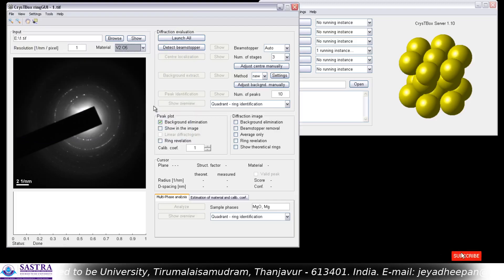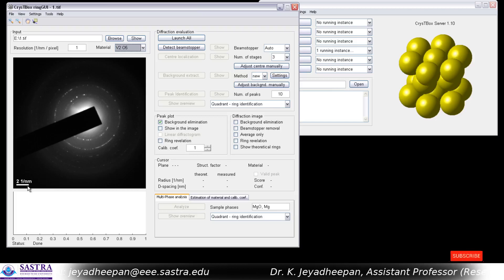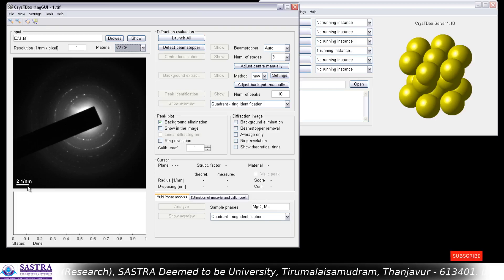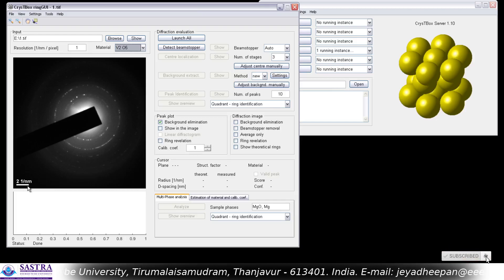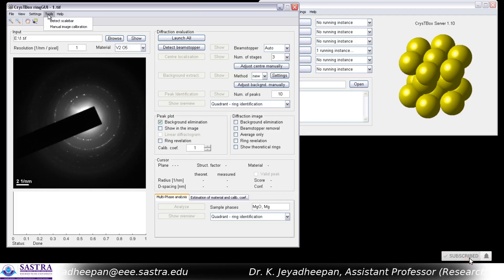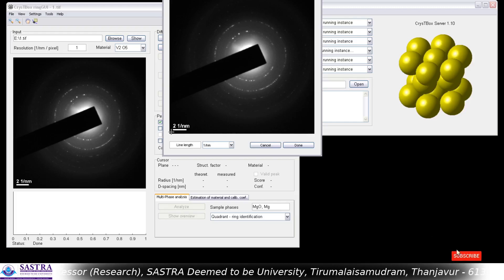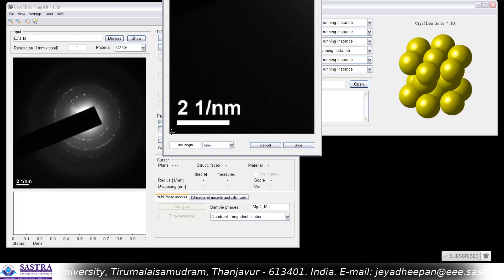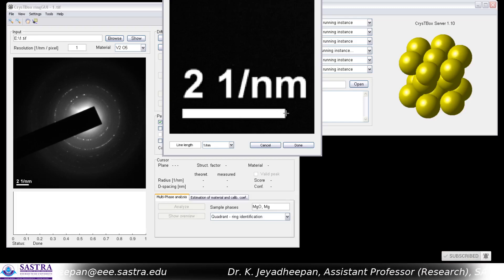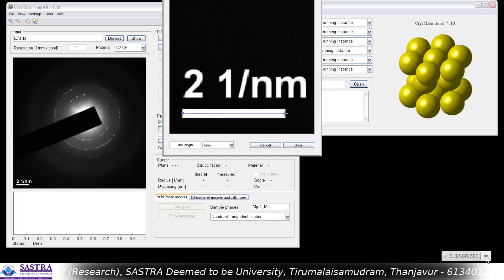Since this image is a TIFF image, it will not have the calibration factor, as in the case of DM3. DM3 files automatically have the calibration coefficient in them, but other image formats do not. So you have to calibrate the image yourself by going to Tools > Manual Image Calibration. A pop-up will open, and by rolling your mouse wheel you can magnify the image. From one end to the other you need to draw a straight line.